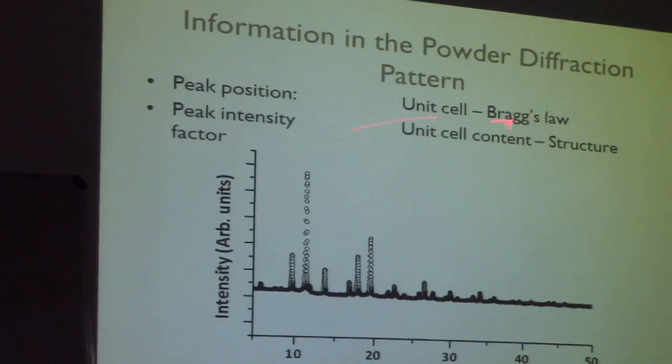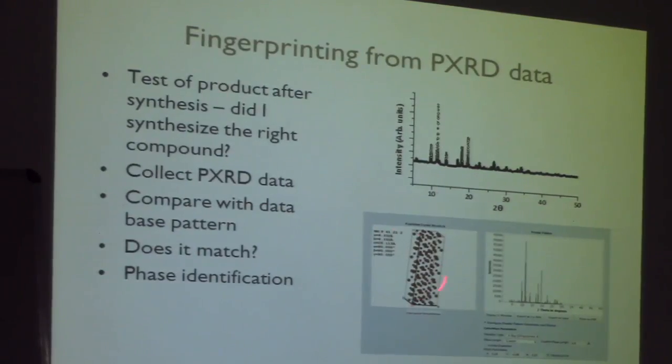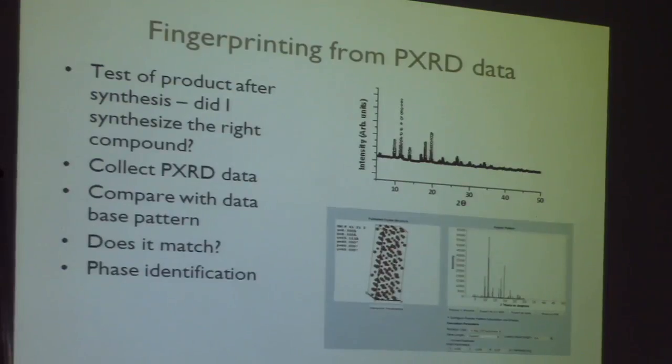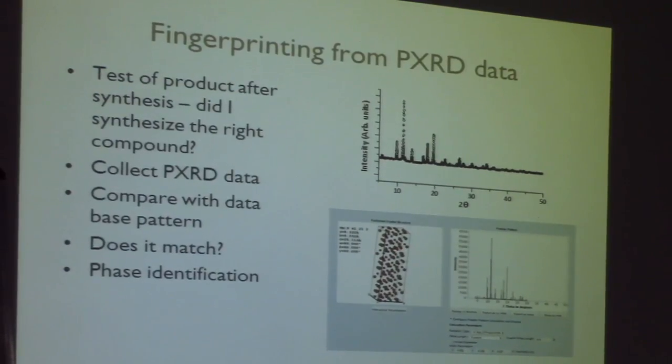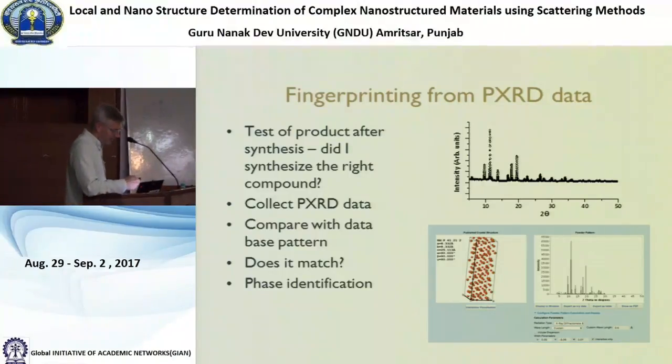And you can pull up different compounds which compare well with your pattern. So now to do this kind of task, this is a very good kind of task for machine learning.